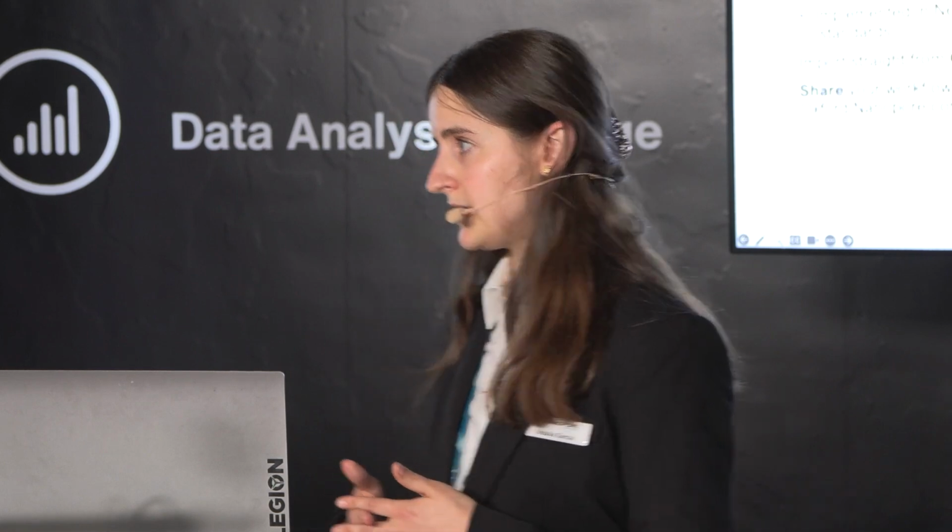Jimmy works as a bioinformatics consultant in Prairie Diagnostic Services. He's also a PhD candidate at Simon Fraser University, and he's the lead developer of Hsiao, which is a workflow to perform Salmonella serotyping in real time. So I'm just going to let him show how you can do this. So thanks, Jimmy. Come here.